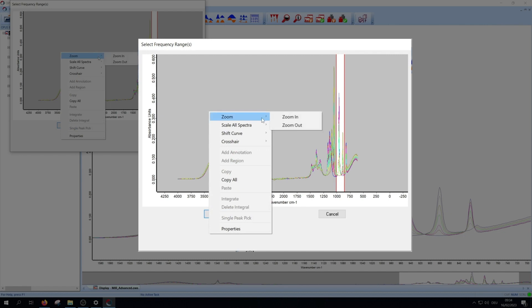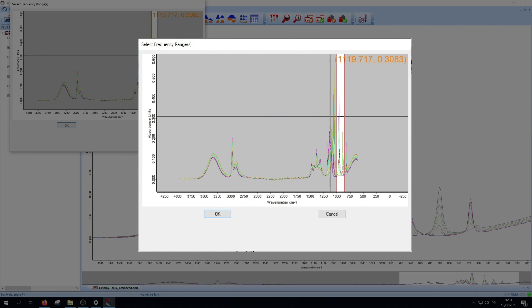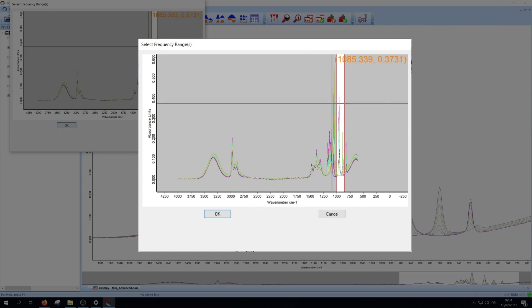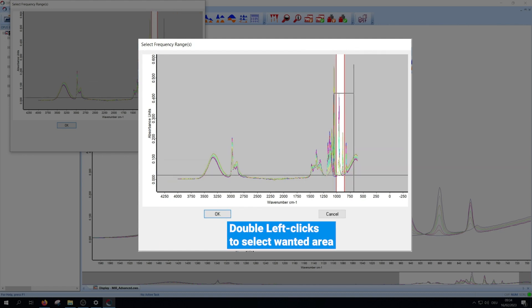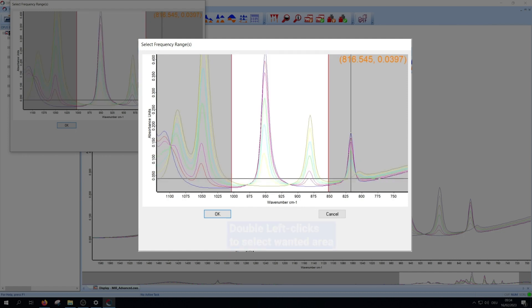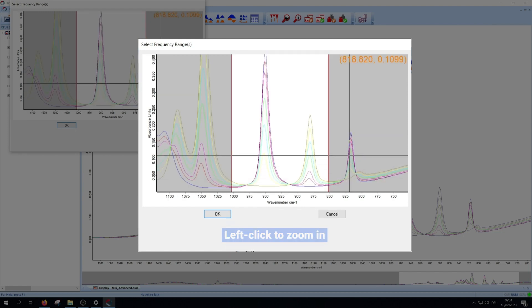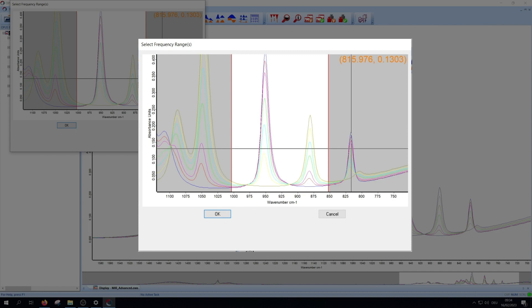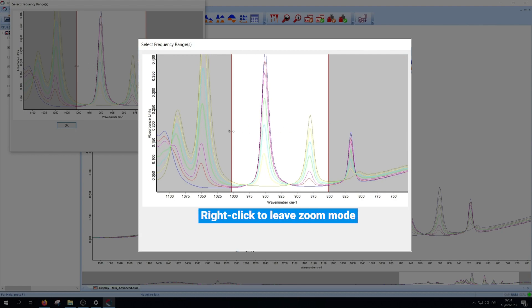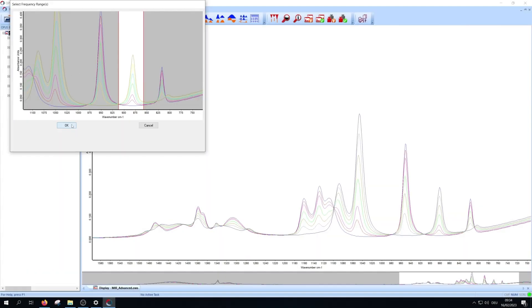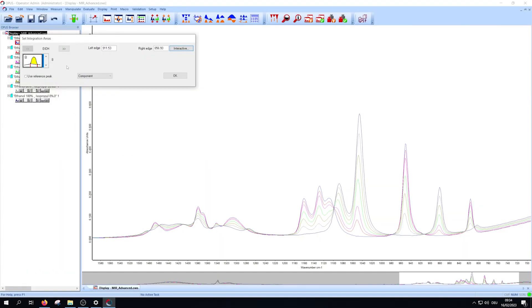Press zoom and zoom in. Select your wanted zoom area via two left clicks and then left click again to zoom in. Deselect the zoom function via right click. Now optimize the integration range. They should be close to peak area. Repeat this for every component. You switch between them with the arrows.